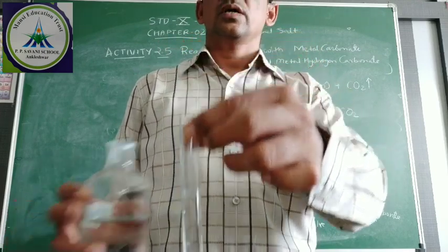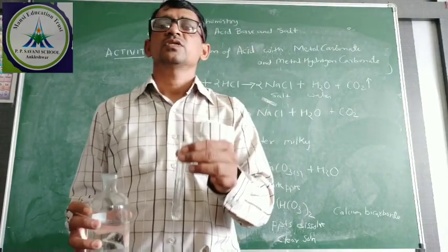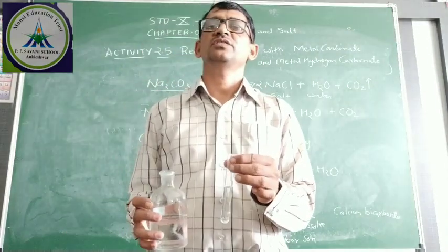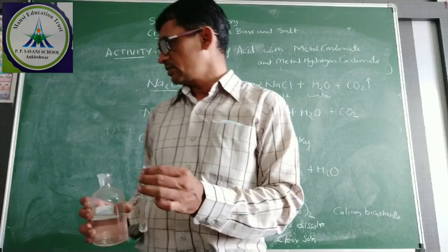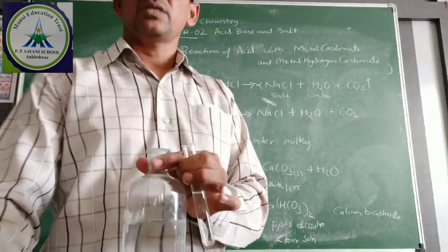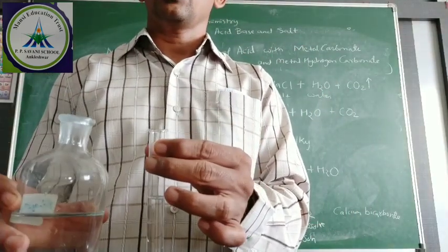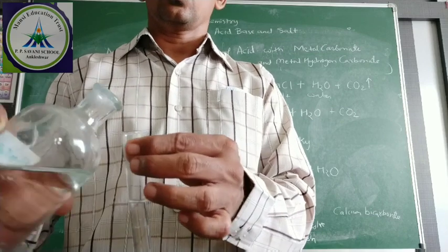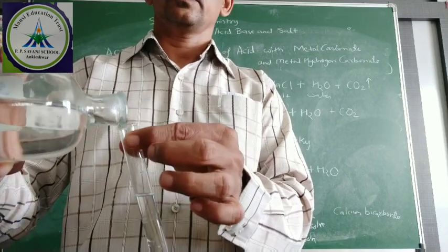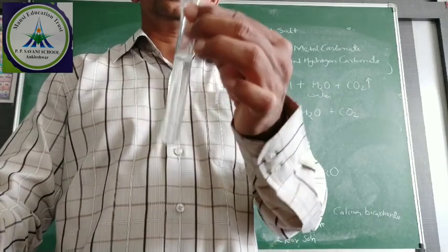Again, the carbon dioxide gas which is produced extinguishes fire, so we will check with the help of fire. I am putting the matchstick here to check that carbon dioxide gas is produced. So I am adding this acid.